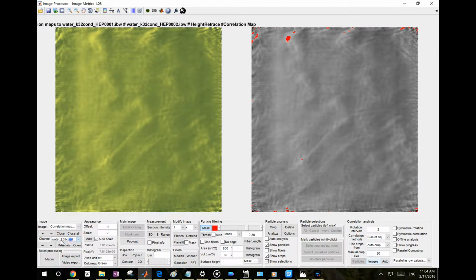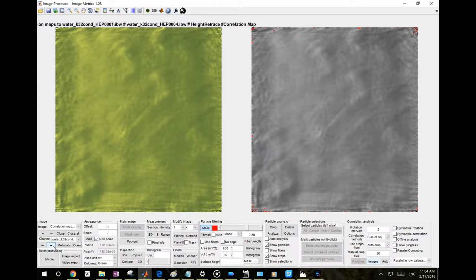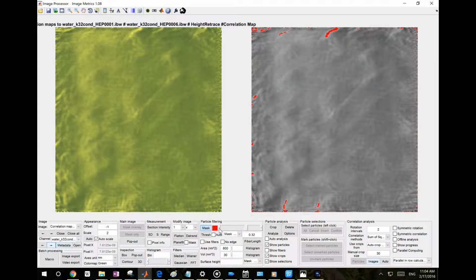Then you can go through various other images. You see that this spot moves upwards. So it means the template moves because the image is drifting. So it looks like the algorithm works pretty fine, and then it moves further upwards. So I have to go down a little bit. See that? And upwards. So you can always find a bright spot in the center.